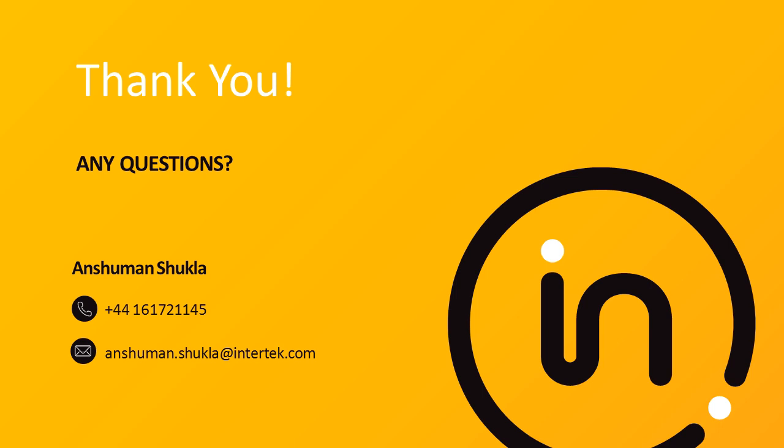Great, thanks, Anshuman. So the first question is, for an orthogonal approach to study secondary structure, for example, how do you decide which are the most suitable techniques?